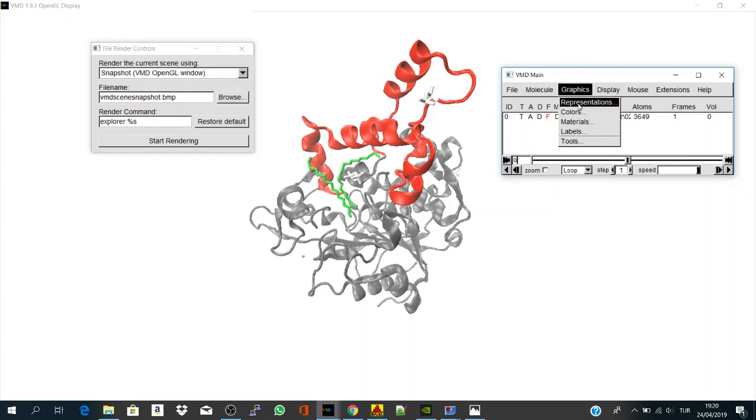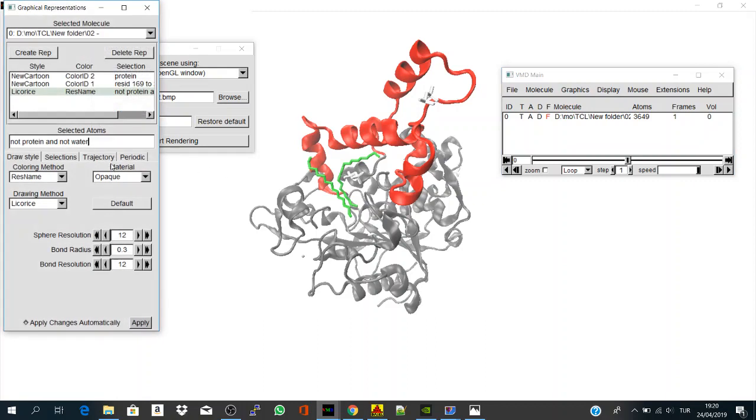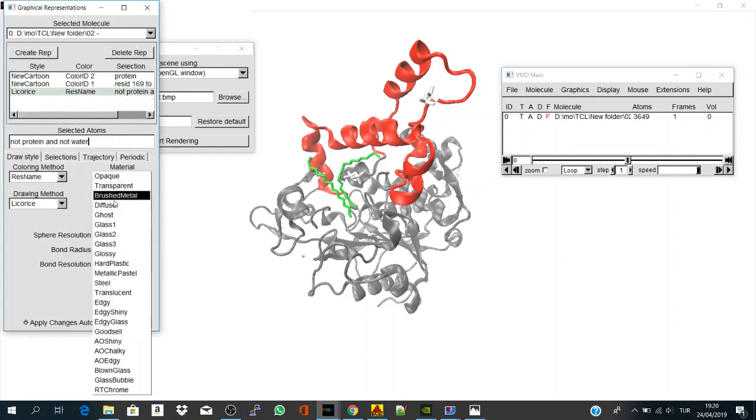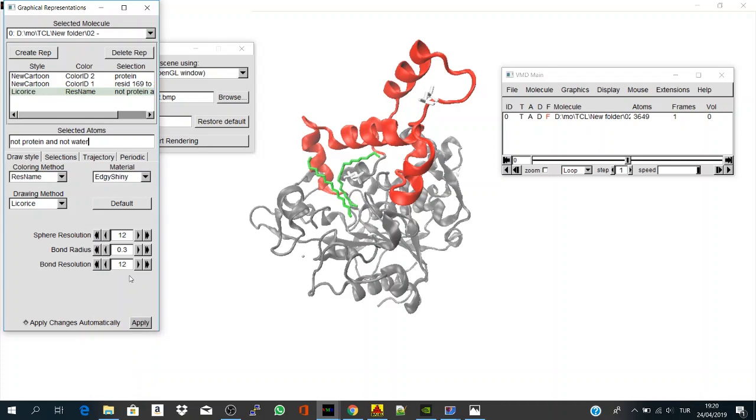So, to go to graphics, representations, and, for example, I like this one, EdgyShiny.